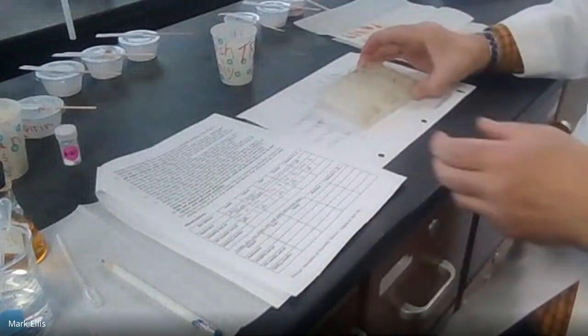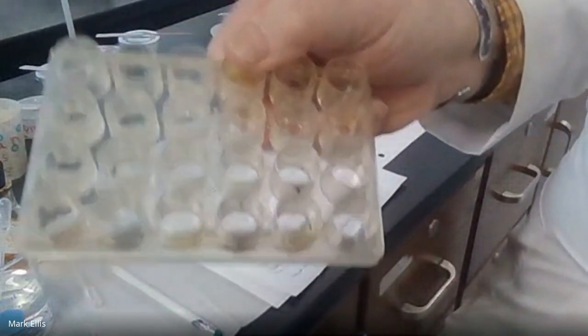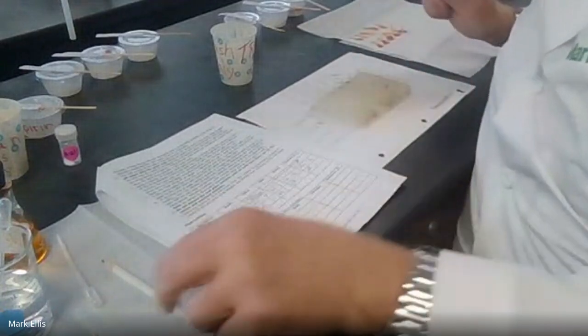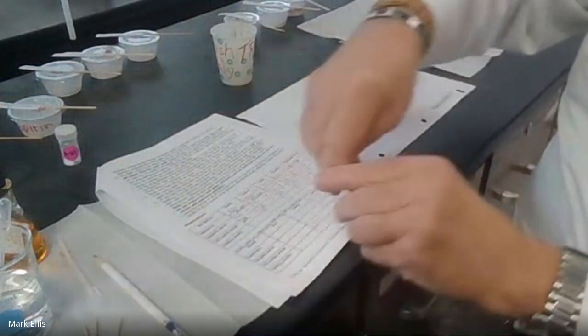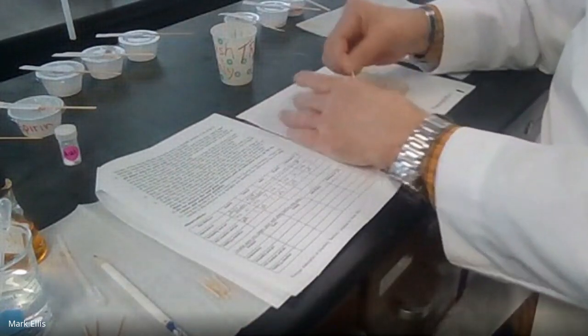And you can see here, there's definitely some color change going on. I'm going to try not to spill this. So definitely some reactions. For the aspirin, if I had a lab partner, they could break off some sticks for me. Give it a stir to get a better reaction, a more comprehensive explanation of what's going on. Again, different toothpick for each well.